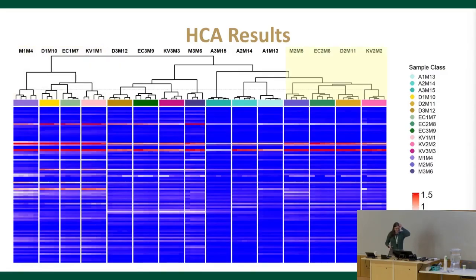And then on the far right of the plot is the groups of mead brewed with 3 pounds per gallon of honey. And here again, we're seeing tight clustering between all of our strains, emphasizing the fact that they are very compositionally similar to one another. And that can be also confirmed by the heat map. We see that they contain very similar volatiles in very similar concentrations.